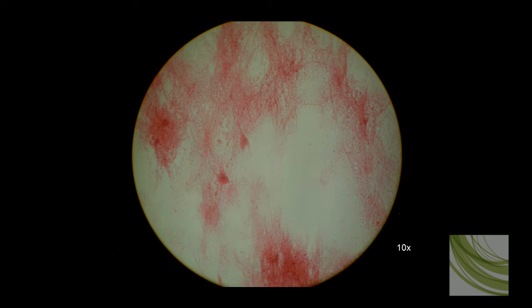Here is another view of the same slide at 10x, a different region of the area. In this one we see a cell body. It looks like we've got a couple of dendrites there and that would lead to an axon.